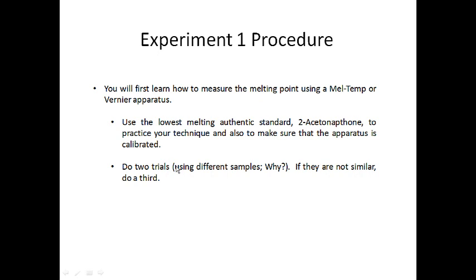We never determine the melting point on a sample in a capillary tube, let it freeze, and then remeasure its melting point. Okay, we never do that. Why not? Because if the sample decomposes while it's melting, you're going to get impurities, and so when you measure the second melting point on the same sample, basically you're going to get a lower melting point.